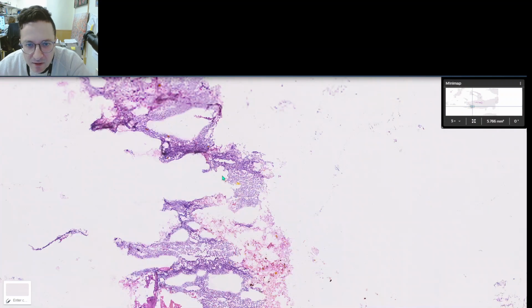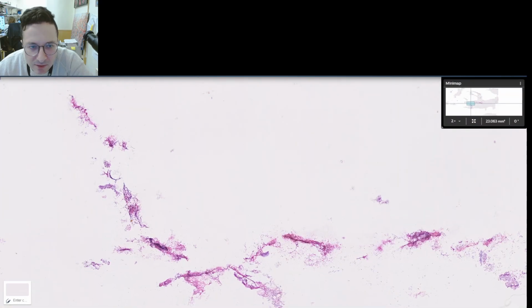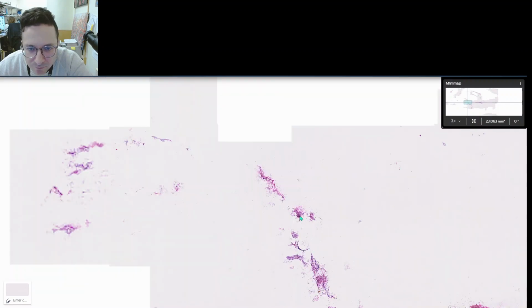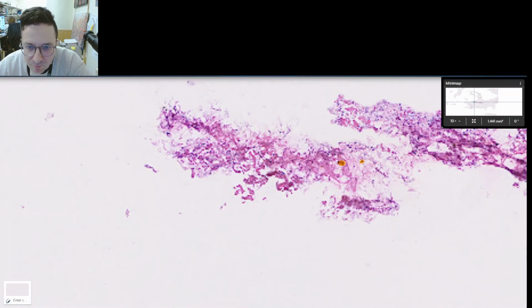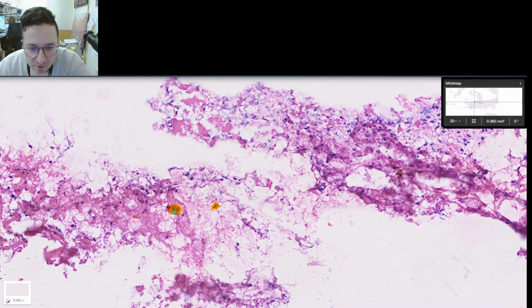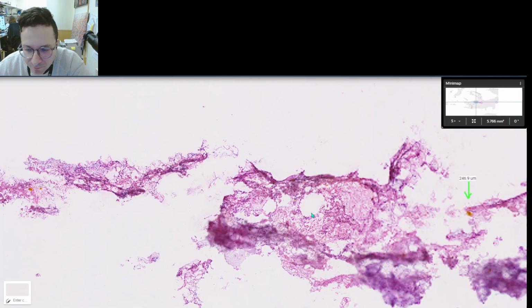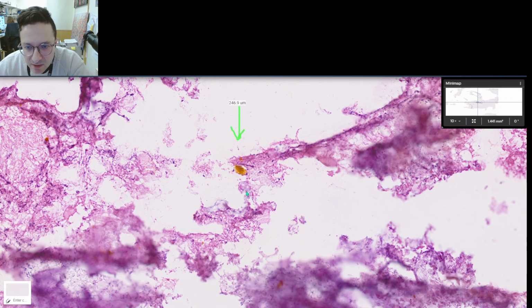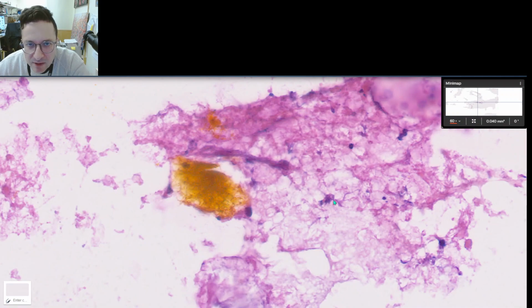So when we look through this frozen, we don't really see normal pancreatic parenchyma. It's mostly just a lot of dead cells, acute inflammation, maybe scattered chronic inflammation. A lot of this hematoidin pigment, which is really cool, and it just says that there was probably bleeding there, and the red blood cells were extravasated. And then here you go, again, more of that hematoidin pigment.